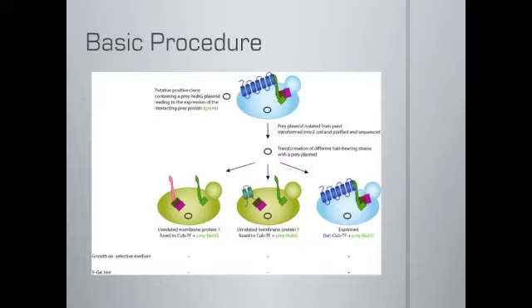And so that would show that our prey protein was dependent on our HspB2 bait. However, if there was growth on the unrelated membrane proteins, it would show that our results were false positive, that the protein that we had isolated was not dependent on HspB2. Therefore, we can determine that it is a false positive. So that's what we do just to ensure accuracy of our results.